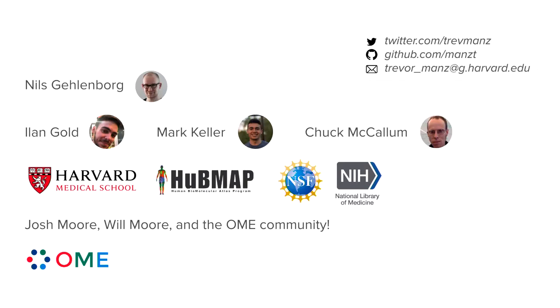We have a question from Jeffrey Moffat online, who says, amazing talk, Trevor. A quick question. Sometimes in microscopy work, it is useful to create a tile of images in which there are overlaps of adjacent fields of view. And Jeffrey just wonders, are there ways to combine images in Zarr in a way that maintains these overlapping regions, yet continues to have all of these benefits of pyramidal representations? I don't know whether this gets too technical, but he says a single file for all FOV and many of the other features. Yeah, that's a great question.